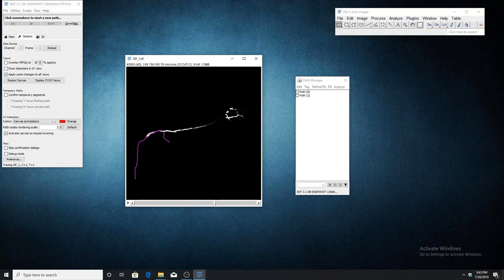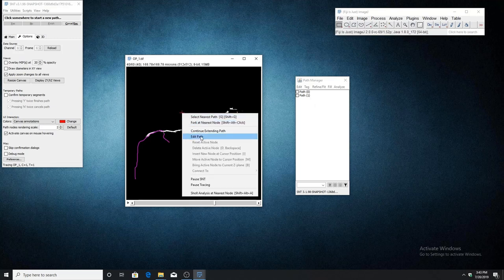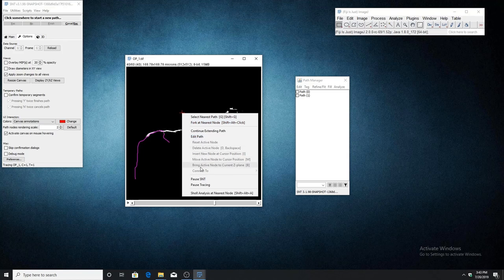In this video, we will go over the path editing features that are found in the right-click contextual menu.